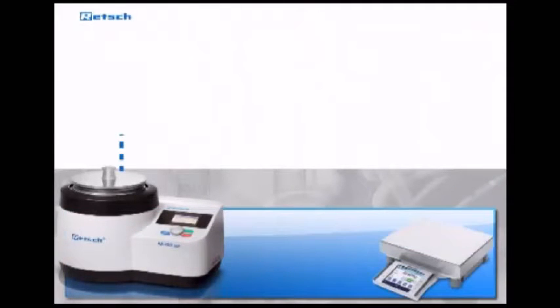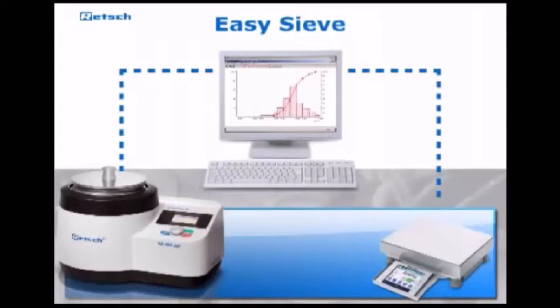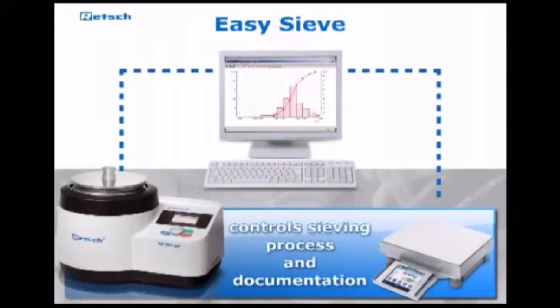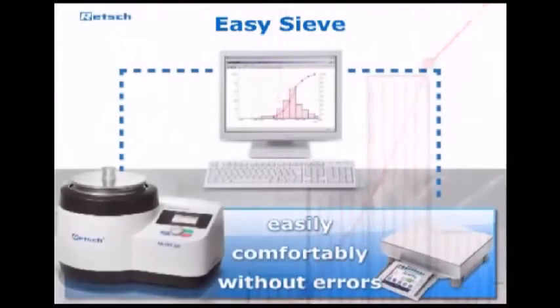Thanks to an integrated interface, the AS200 jet can be controlled with the evaluation software EasySieve. This program allows you to control the entire sieving process and the subsequent documentation easily, comfortably, and without errors.